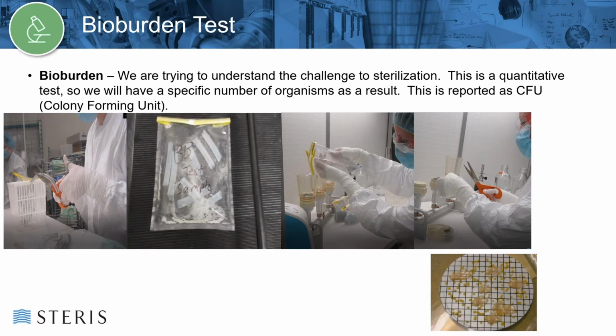We perform testing on certain media types or test conditions to better categorize and understand the bioburden. We can also perform organism identification on recovered colonies to further understand potential sources of contamination.